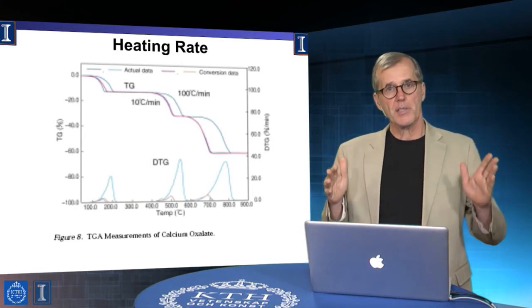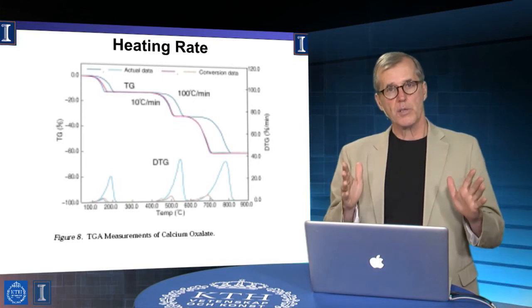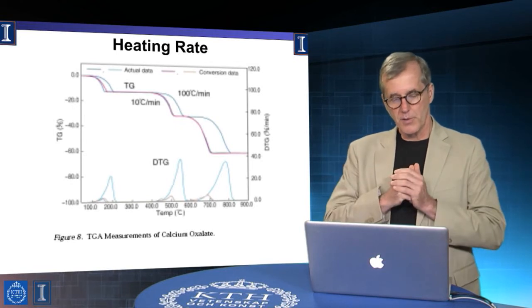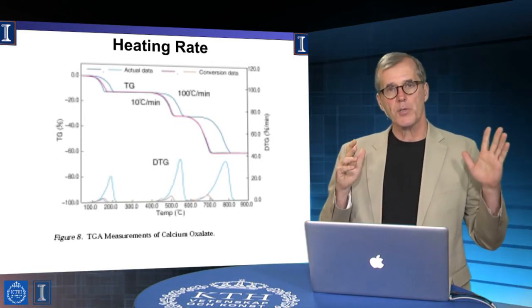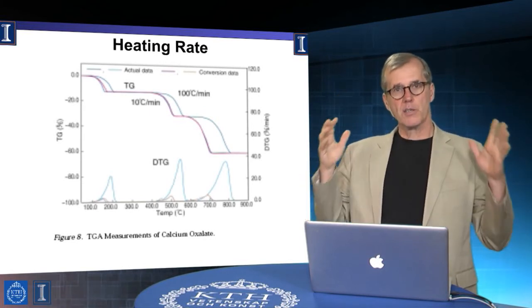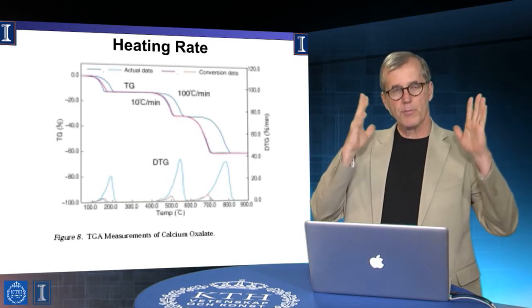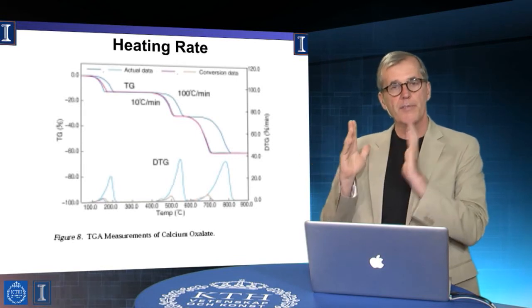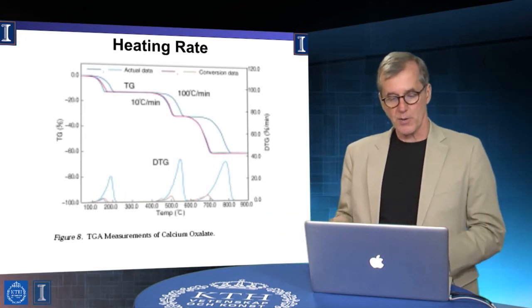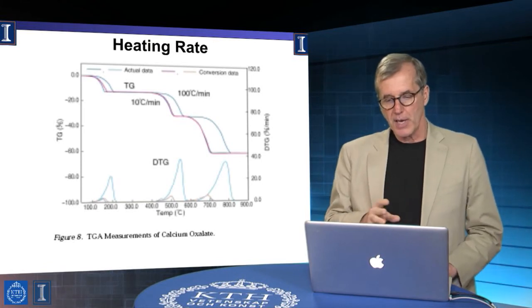And that is, in the first case, I scan temperature exactly at a rate of 0 degrees centigrade per second, okay? I mean, basically not at all, right? There's no data, okay? And then I scan the temperature at 10 gajillion degrees centigrade per second. Basically, from room temperature to supernova in a femtosecond. And at that limit, there's no information either. It's way too fast, right? So, there are in fact optimal scan rates, right?